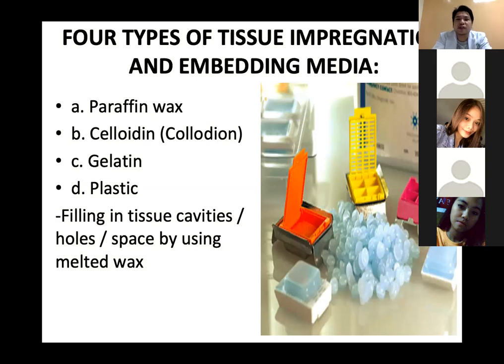What is the use of those impregnating media? They fill in the tissue cavities, holes, or spaces using melted wax. Those spaces in the tissues were previously occupied by tissue fluids. Didn't we extract the tissue fluids during dehydration? So we put the infiltrating medium in replacement of those tissue fluids.